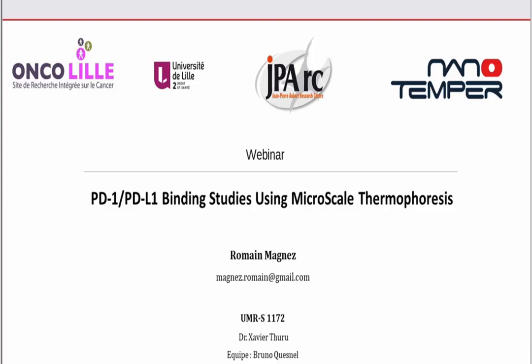Thank you, Elizabeth. Good morning or good afternoon, everyone, depending on where you're from. I want to thank Nanotemper and CHI for giving me the opportunity to talk about the work we are performing in Lille. So I'm going to talk to you within the next minutes about the PD-1, PD-L1 pathway and how we use the MST to study those proteins.